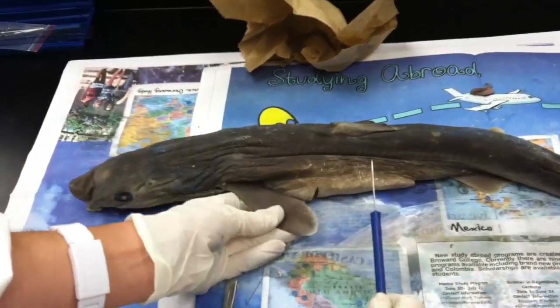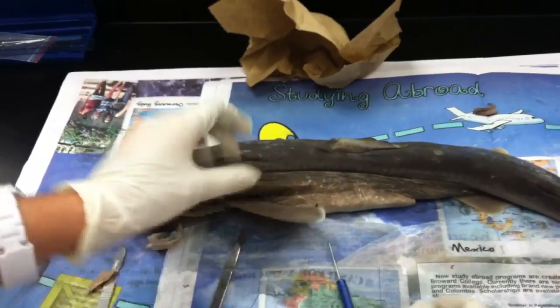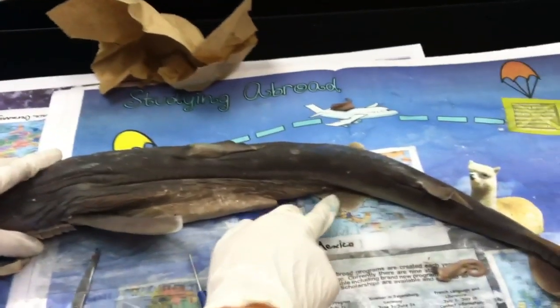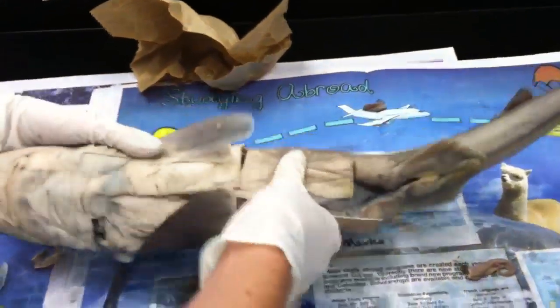Pectoral fins are here. Pelvic fins are here. Claspers are over here — these little guys — which means it's a male.